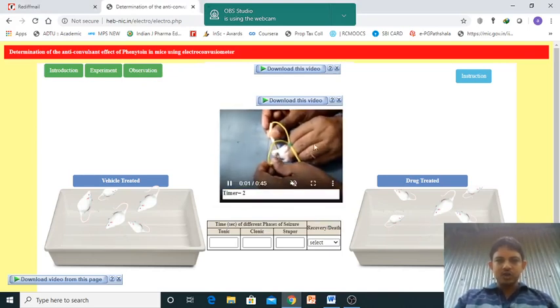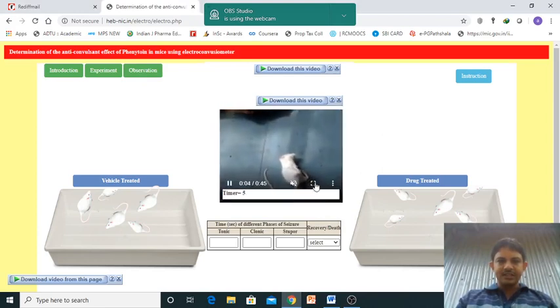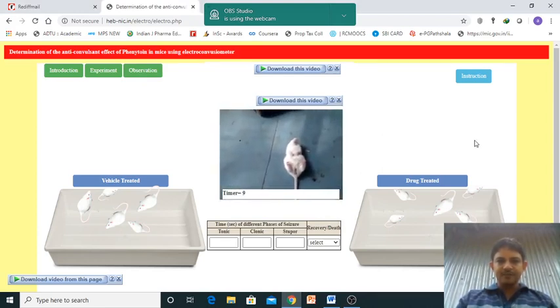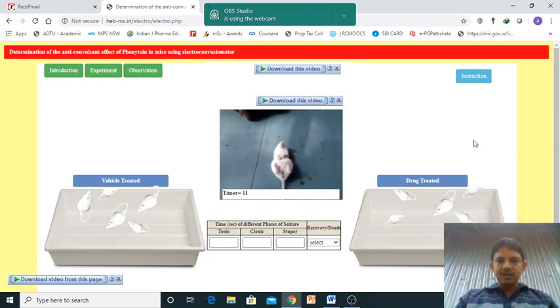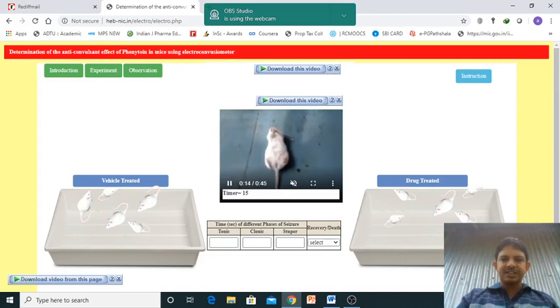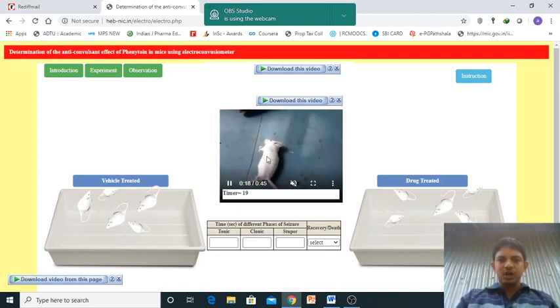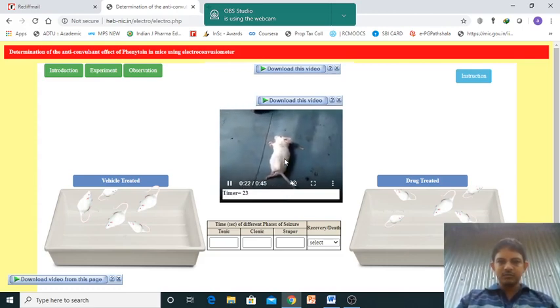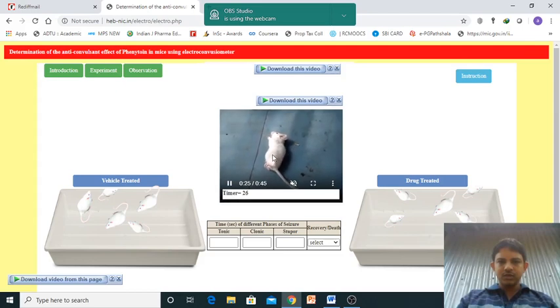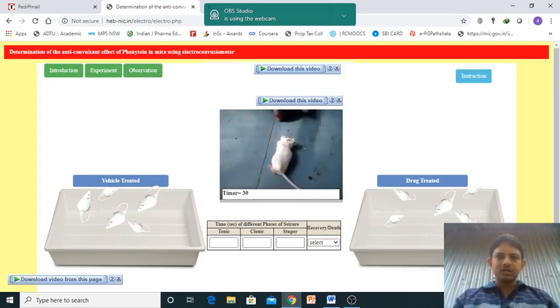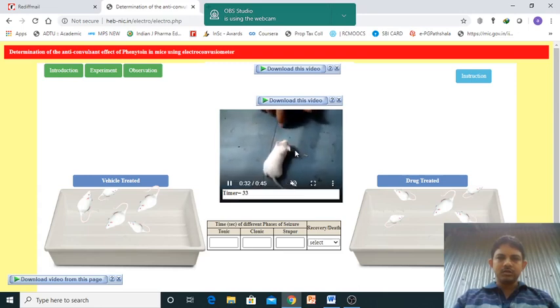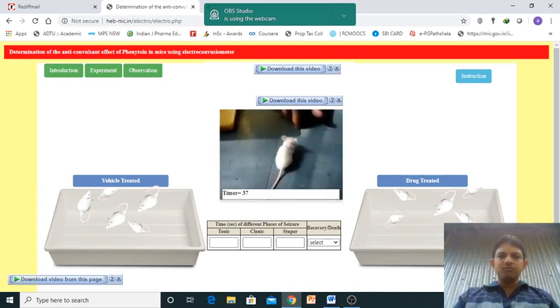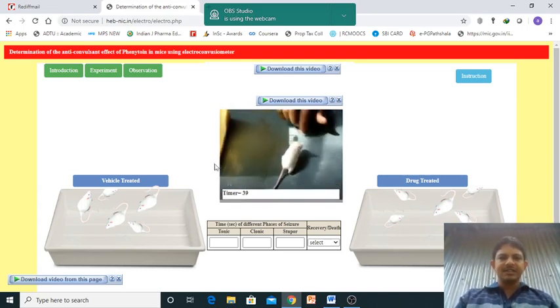Now we'll give more shock - shock is given for 0.2 seconds. See, this is the tonic flex - tonic play phases are there. This is the extension phase, though it is very minimal seconds in the extension phase, and then now it is coming back into the clonus. This is the clonus phase.